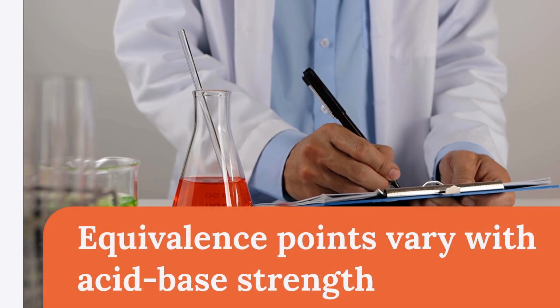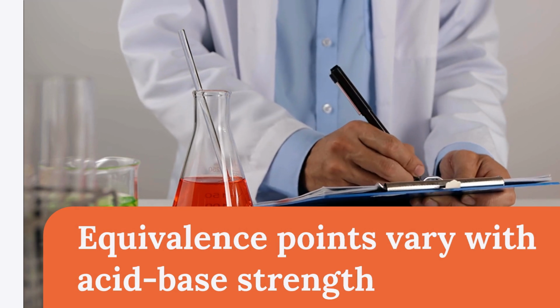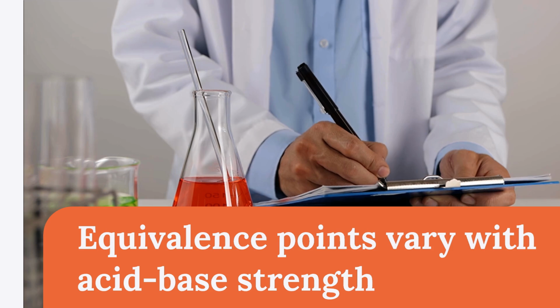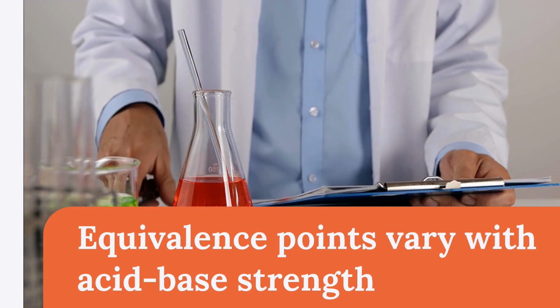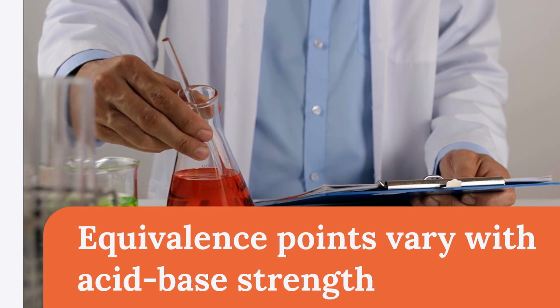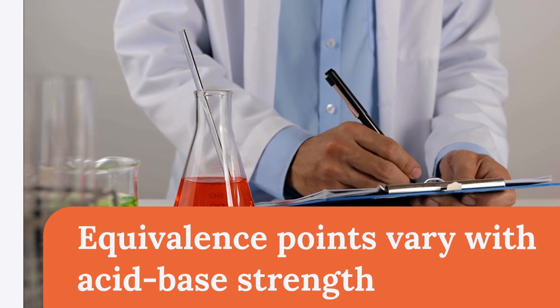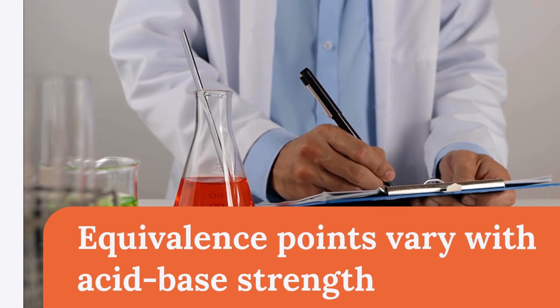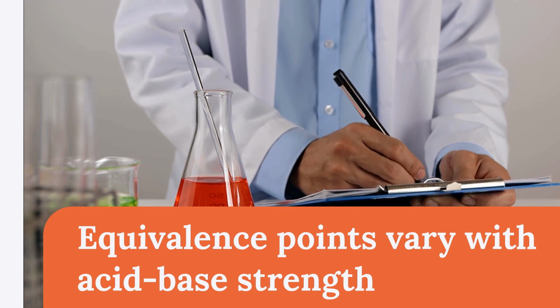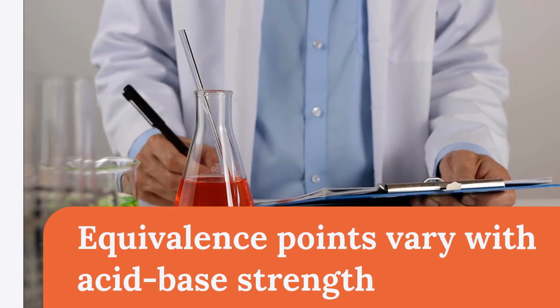The aim was to compare pH changes when weak acids react with strong bases and vice versa. The hypothesis predicted different equivalence points based on acid and base strength. Weak acid and strong base would have an equivalence point above pH 7. Strong acid and weak base would have it below pH 7. Results supported the hypothesis, showing expected pH changes.